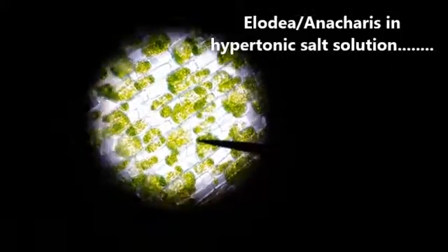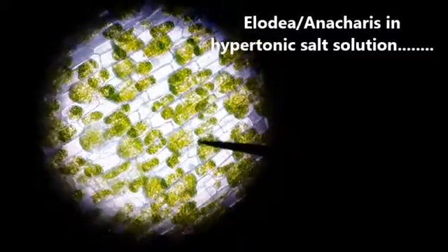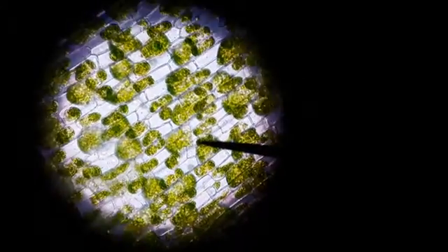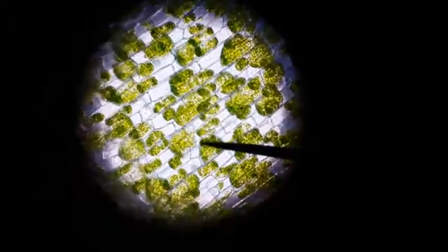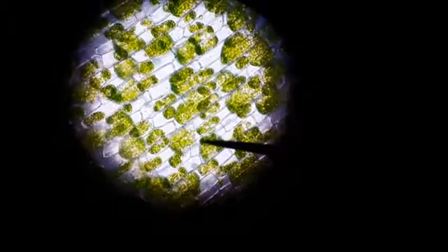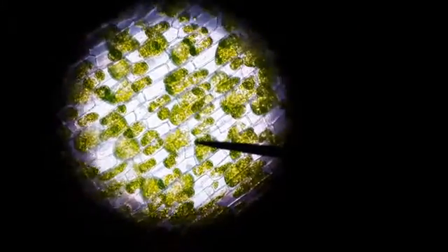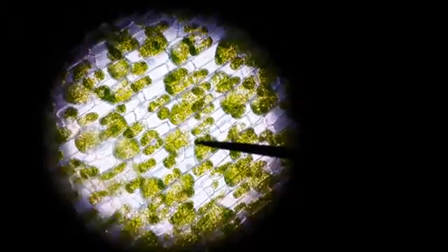This is the dramatic effect of hypertonicity on the inside of a plant cell. Not the cell walls, but the cell membranes have collapsed. Cell walls are made out of cellulose and they're not going to collapse - they're going to keep their shape.